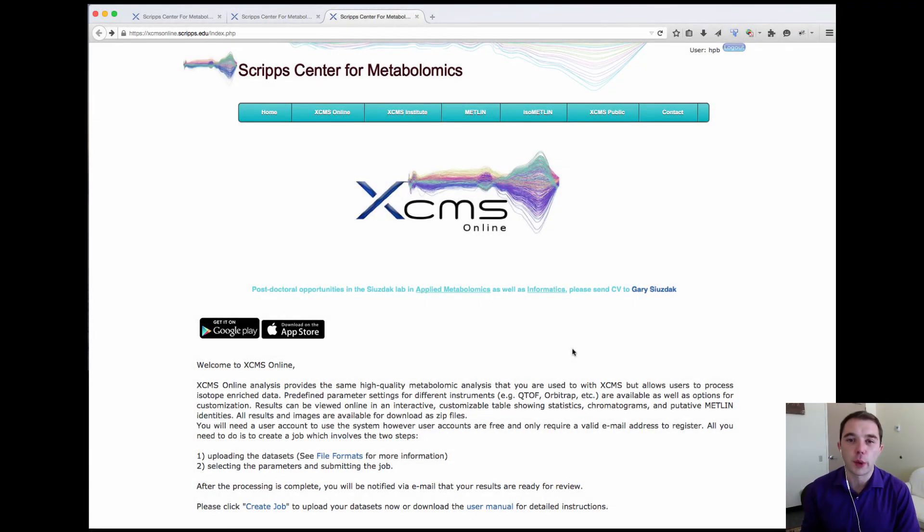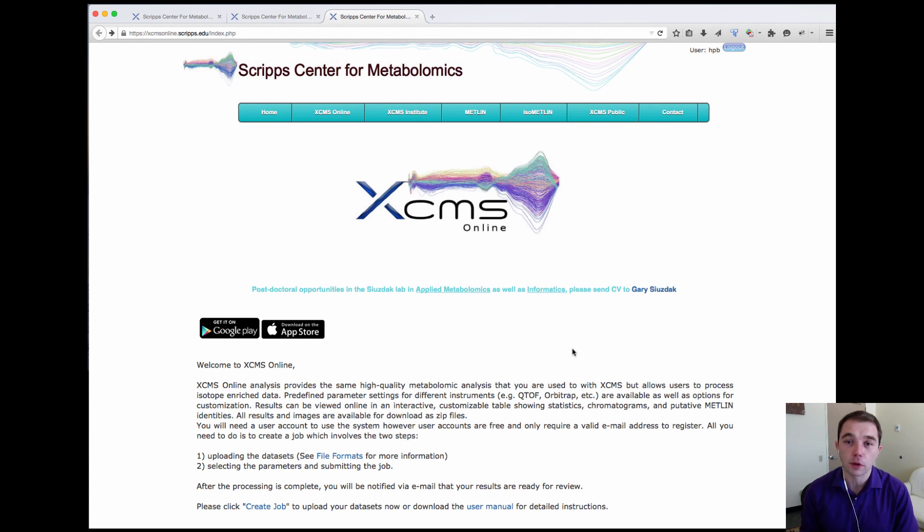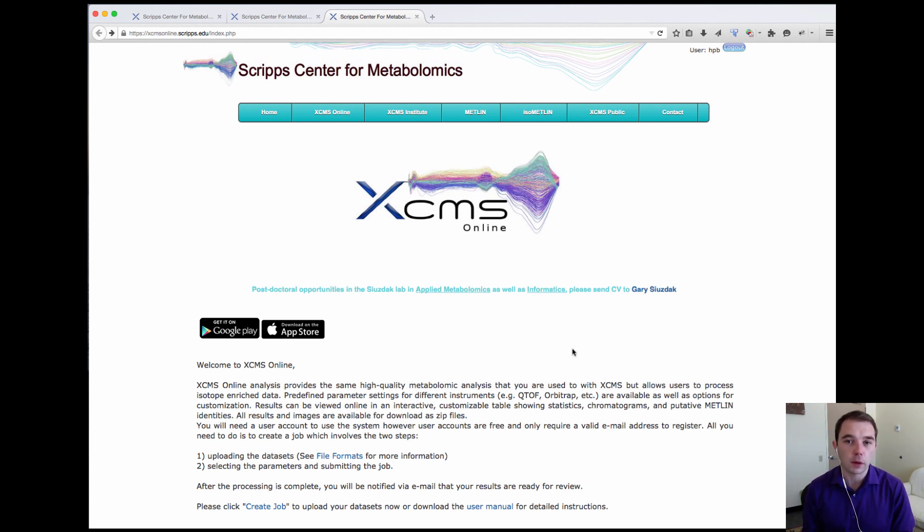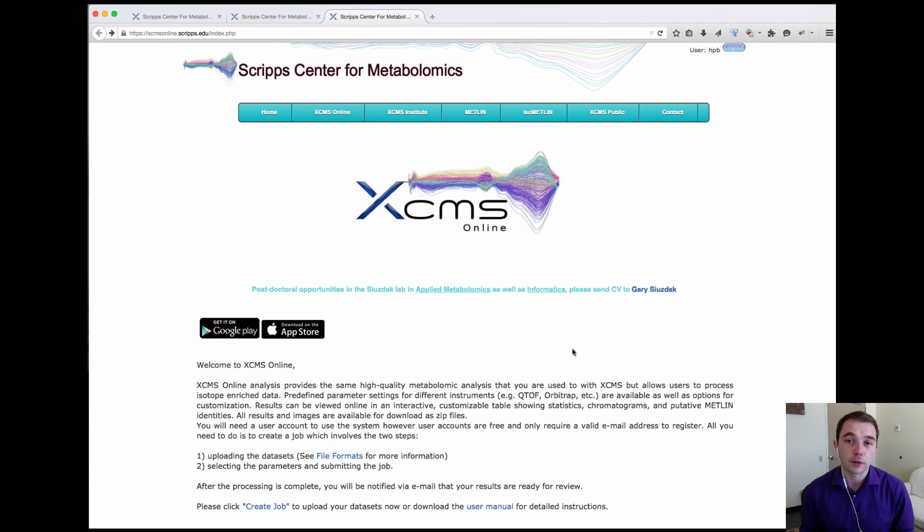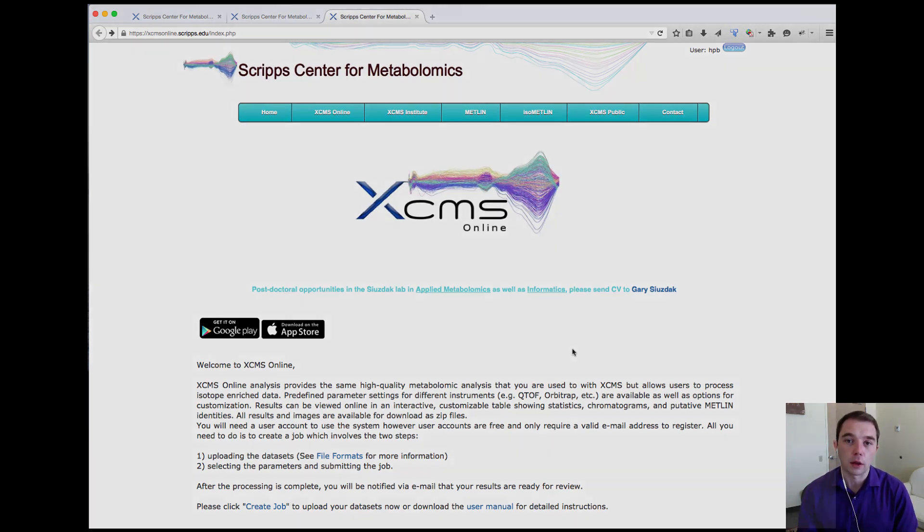Hello and welcome to XCMS Institute. Today I'm very excited to tell you about the Autonomous MSMS Matching System that we've just launched. This system allows you to search your MSMS data that you've uploaded to XCMS Online and visualize and interact with the data in the XCMS Online interface.